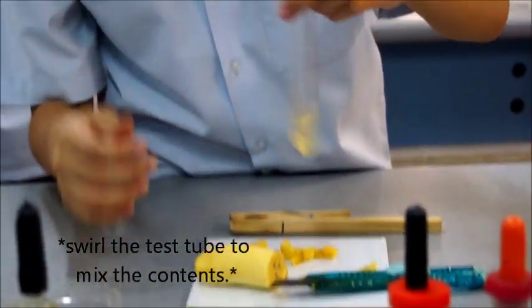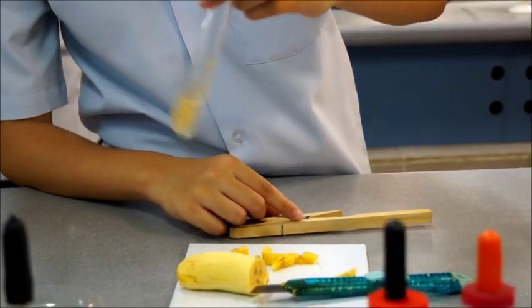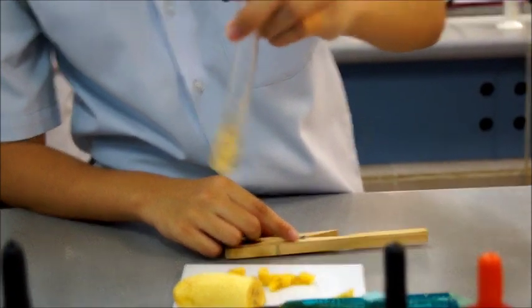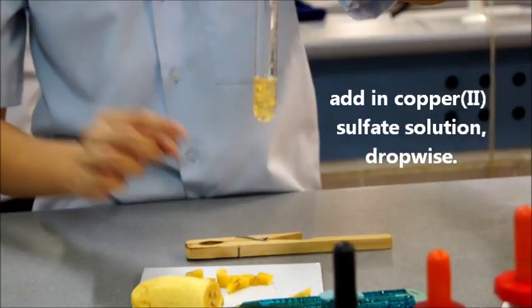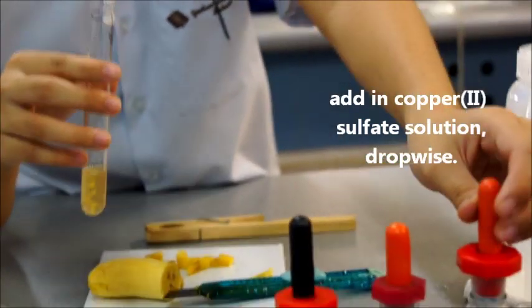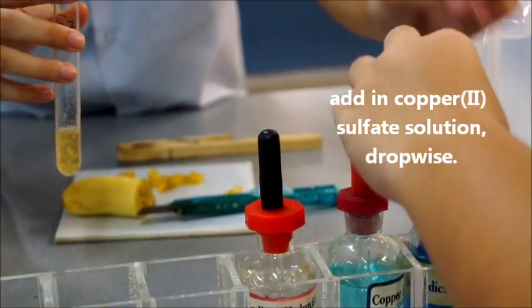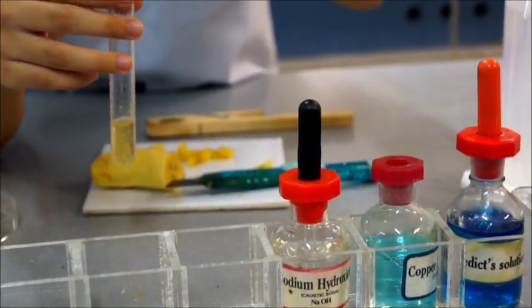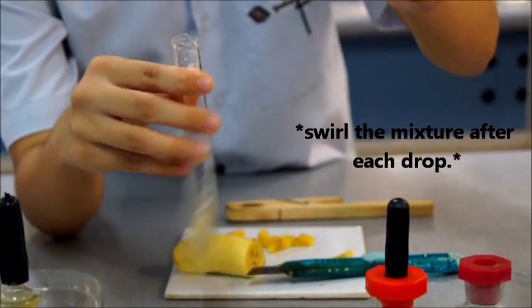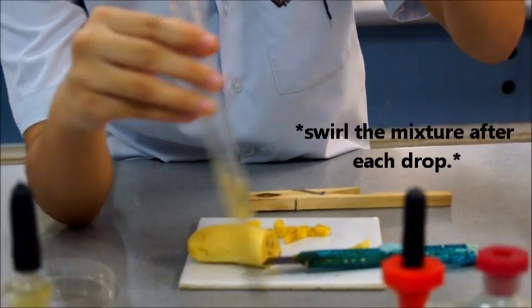Swirl the test tube to mix the contents. Add in copper(II) sulfate solution dropwise. Swirl the mixture after each drop.